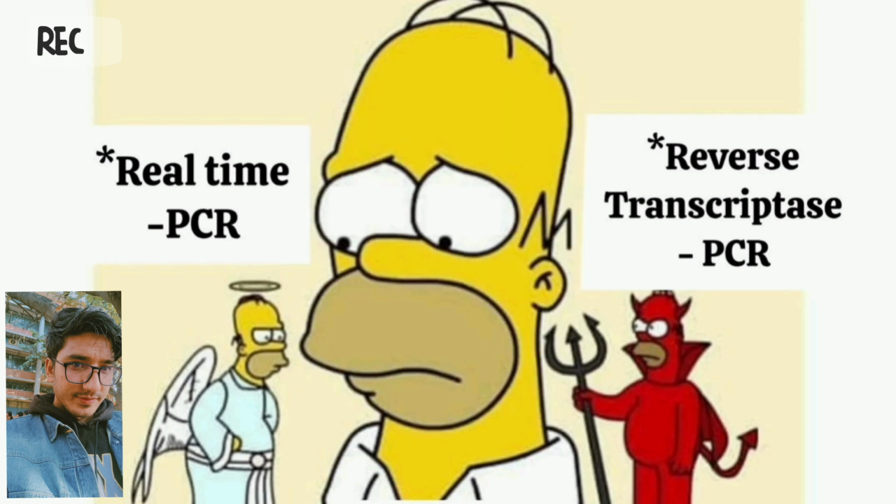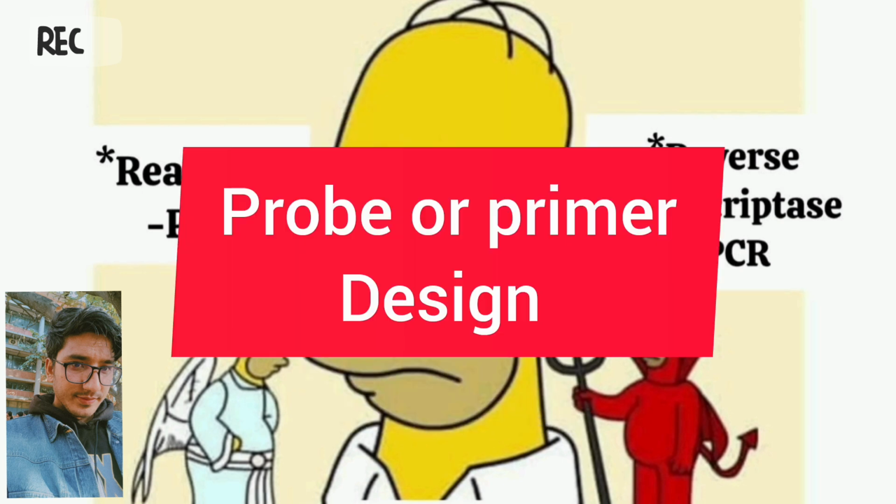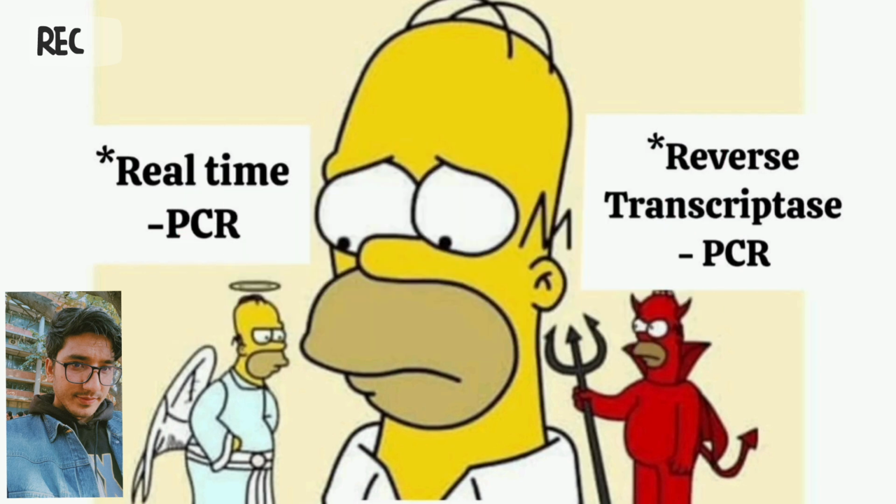So how do we design a primer or a probe? In real-time PCR, we use specific DNA probes and primers to target the DNA region of interest, the region we want to amplify. But in reverse transcriptase PCR, we require primers specific to the cDNA, the complementary DNA obtained from the reverse transcription step. So let's talk about the quantification method.